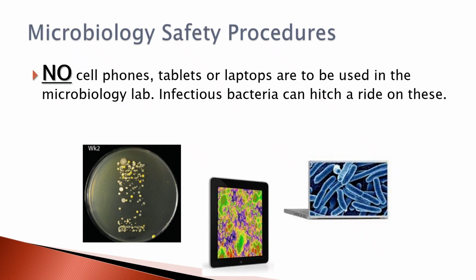Additionally, no cell phones, tablets, or laptops are to be used in the microbiology lab. Infectious bacteria can hitch a ride on these and then you take them home. So we don't use any of those things in our lab.